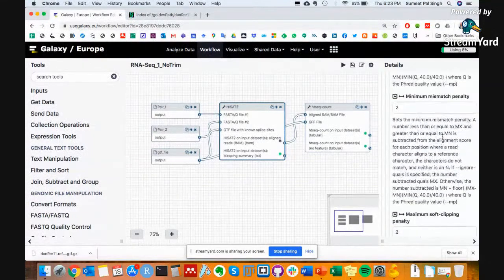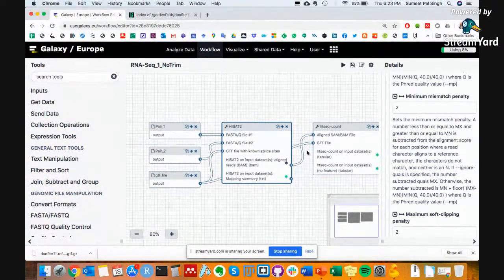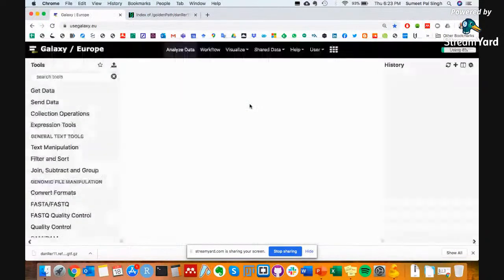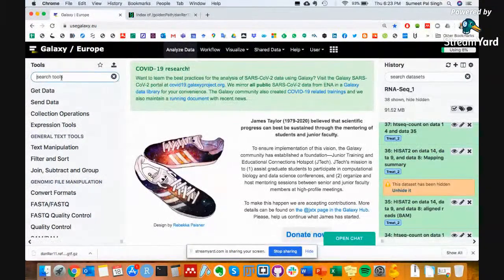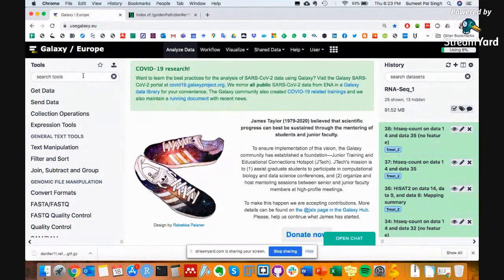If you think that your sample, your data is being affected by not trimming, then do it. It's just a matter of taking more time. Yeah. But with these new mapping software tools, it's not something necessary. Okay. So now we can go to differential gene expression analysis, and it's super easy. That's why I took a bit more time discussing all of these details.